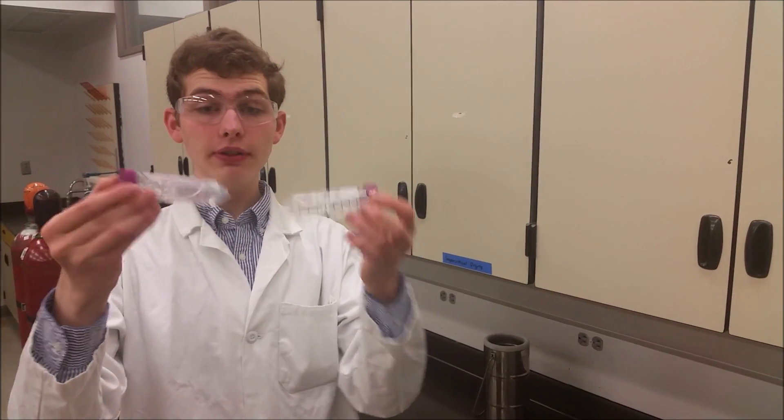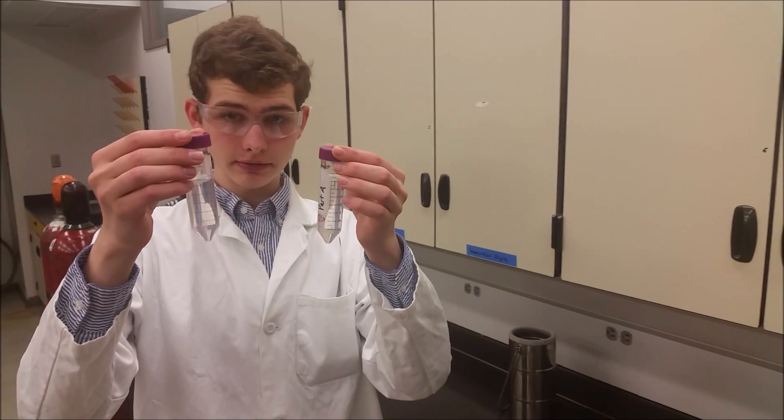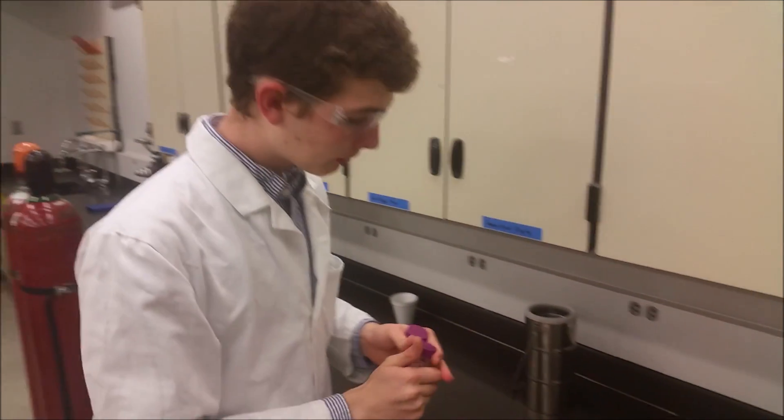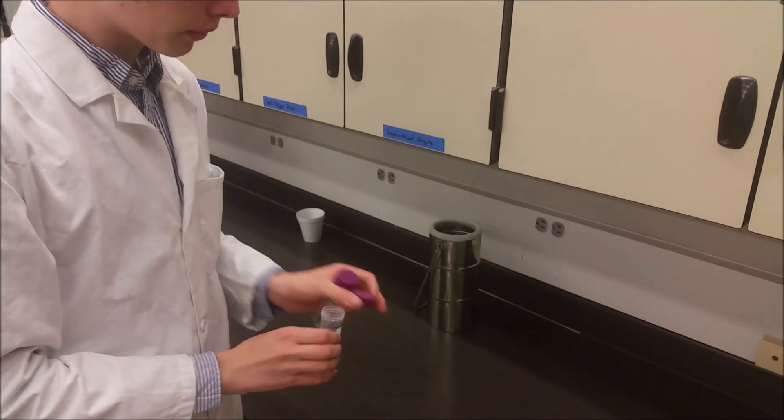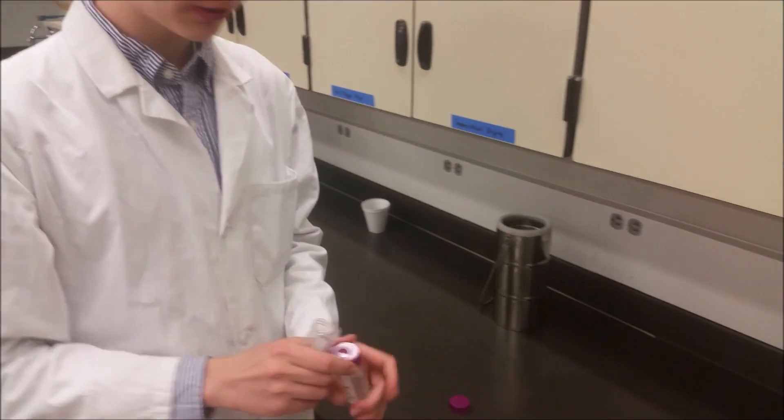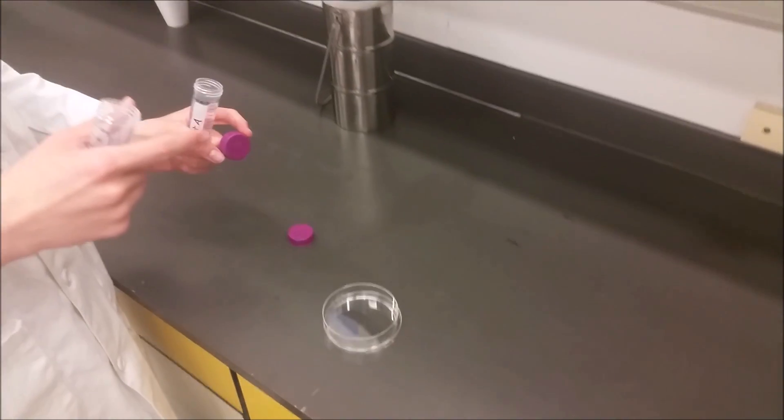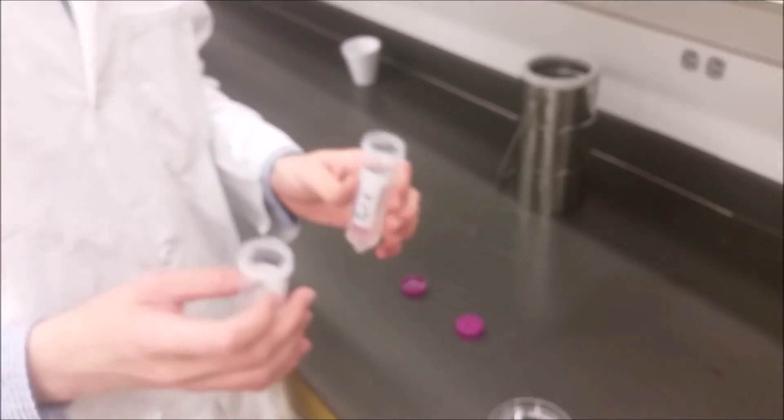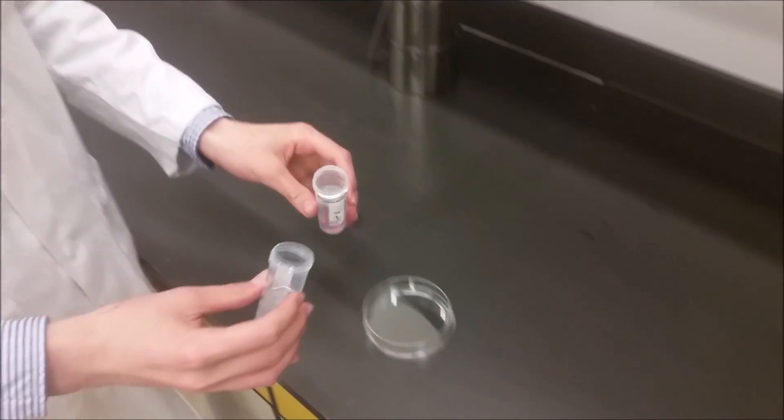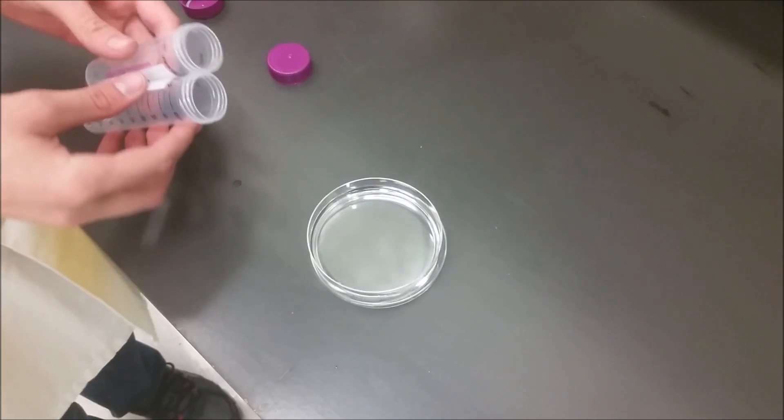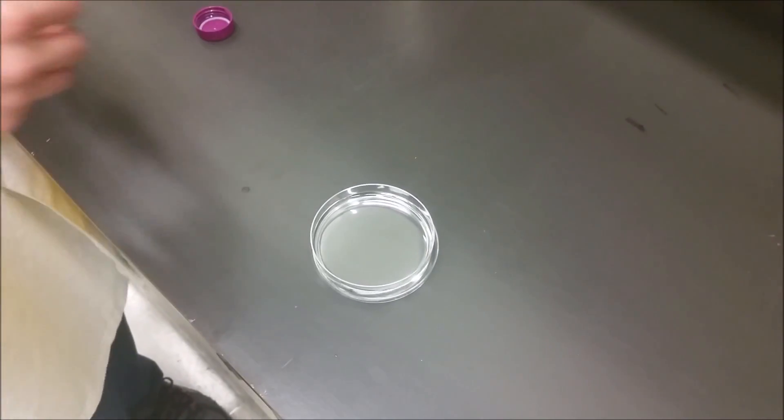So as you can see, these are both very liquid solutions in these vessels. What I'm going to do is pour them both into the same petri dish, and they're going to react with each other to form an alcogel. That's a gel with alcohol in its pores. So we're going to pour it in, and if we're lucky, it's going to happen very quickly.